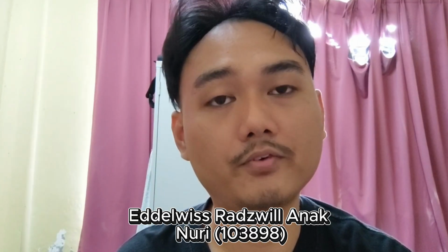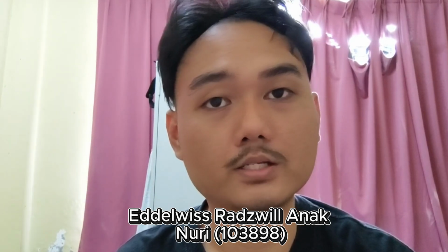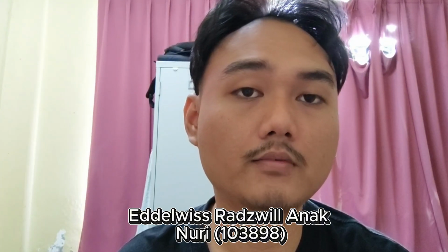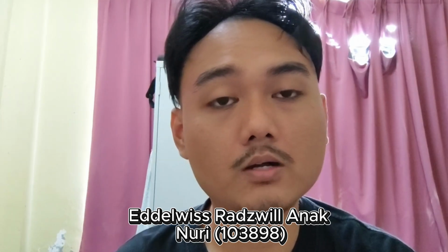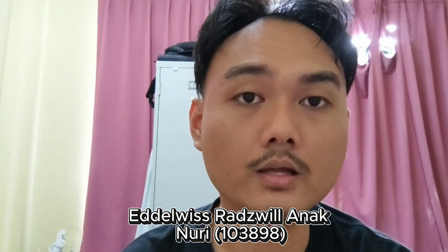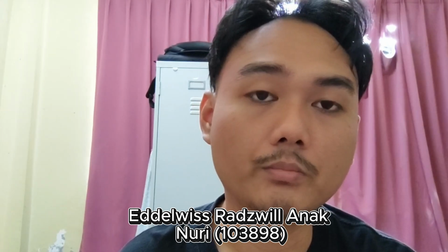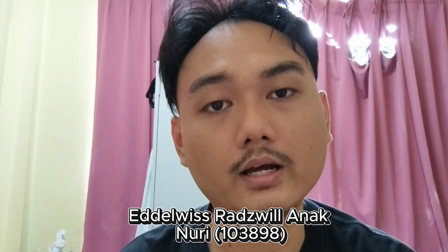I'm Luis. In this experiment, I learned how the Bradford reagent is used to measure protein concentration based on absorbance. It really helped me understand how absorbance relates to protein level, which helps us to calculate unknown sample concentration. One challenge I faced during the lab was pipetting accurately, and timing the spectrophotometer reading was also tricky, as the color changed quickly. So to improve, I would focus more on precise pipetting and better timing when taking readings.